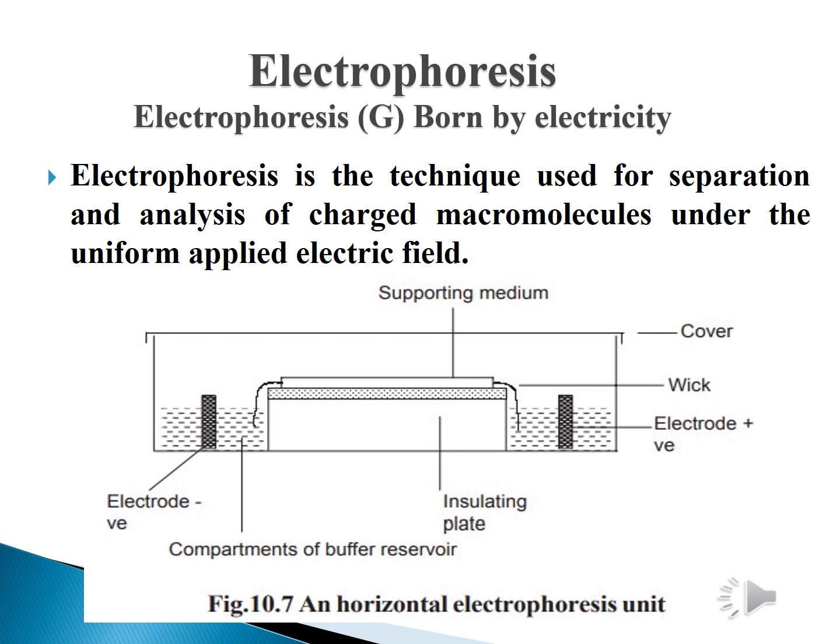DNA is totally negatively charged because of the presence of phosphate ions. Similarly, proteins are either positively charged or negatively charged based on the nature of the amino acids present. If a protein is rich in basic amino acids such as lysine, arginine, and histidine, those amino acids are rich in cationic charge. In the same way, if a protein is rich in acidic amino acids such as aspartic acid and glutamic acid, those proteins are negatively charged. Therefore, separation will be attained, whereas chargeless substances such as carbohydrates are not separated by this method.